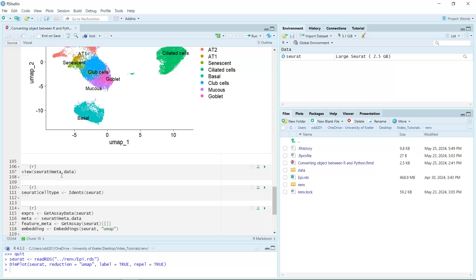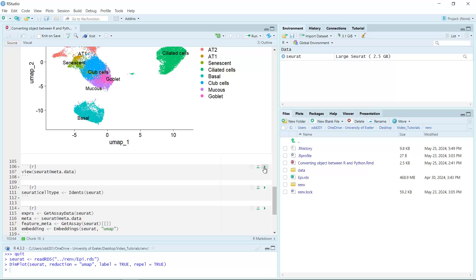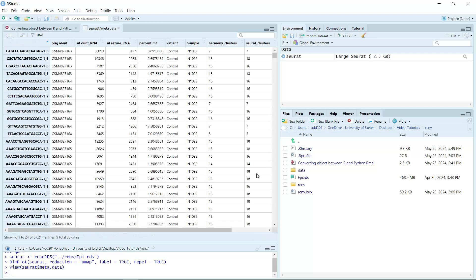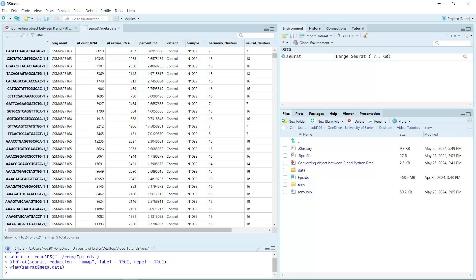We can use the meta.data slot to see the Seurat metadata. You can see the row names are the cell barcodes. We have the orig.ident column for the sequencing ID and nCount_RNA.